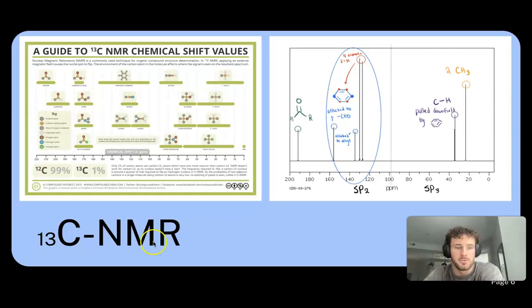So now moving on to the carbon-13 NMR. Again, I have the guide over to the left to help you figure out some of the values with the chemical shifts and what structures those may relate to. This time I'm going to show you what I figured out on the right, and then talk about it more in depth.